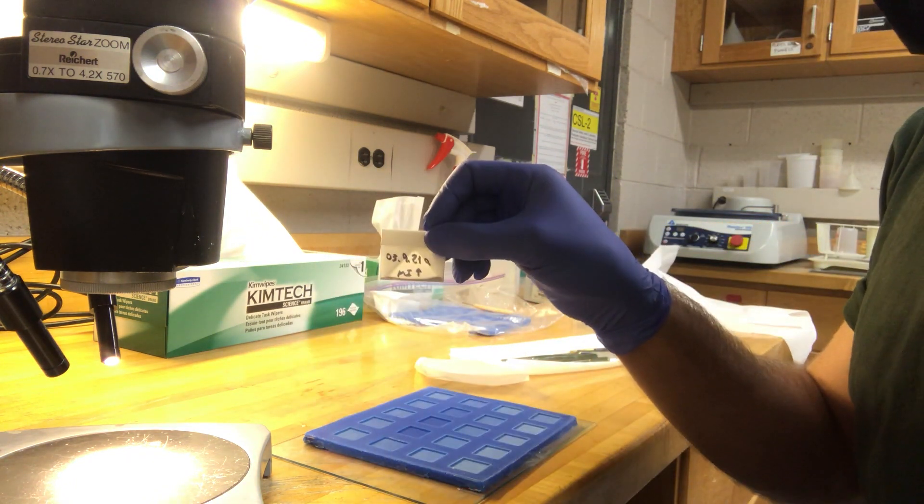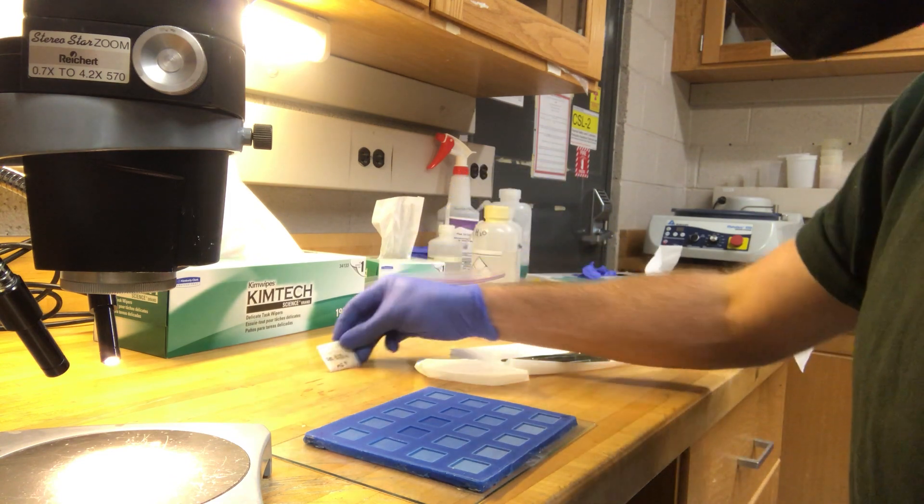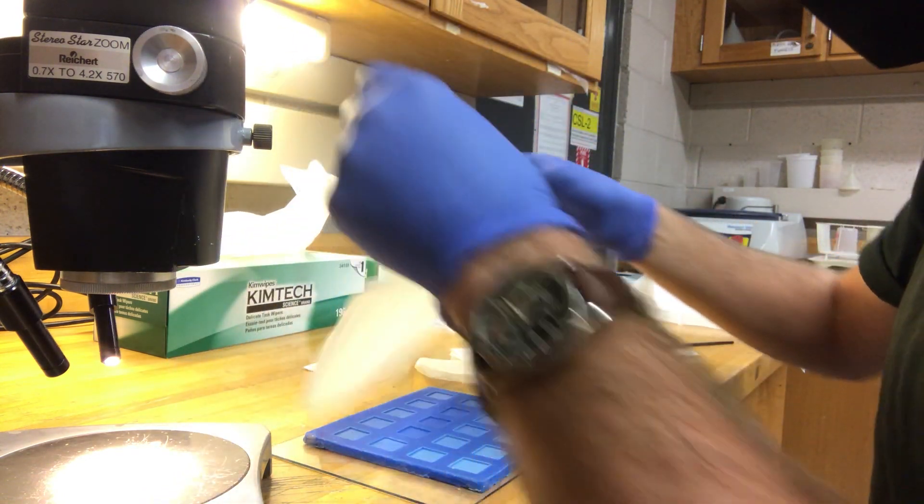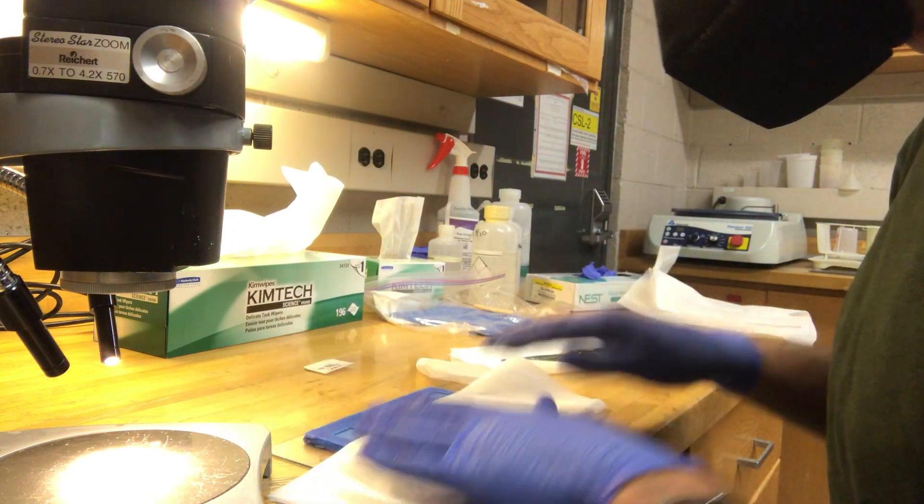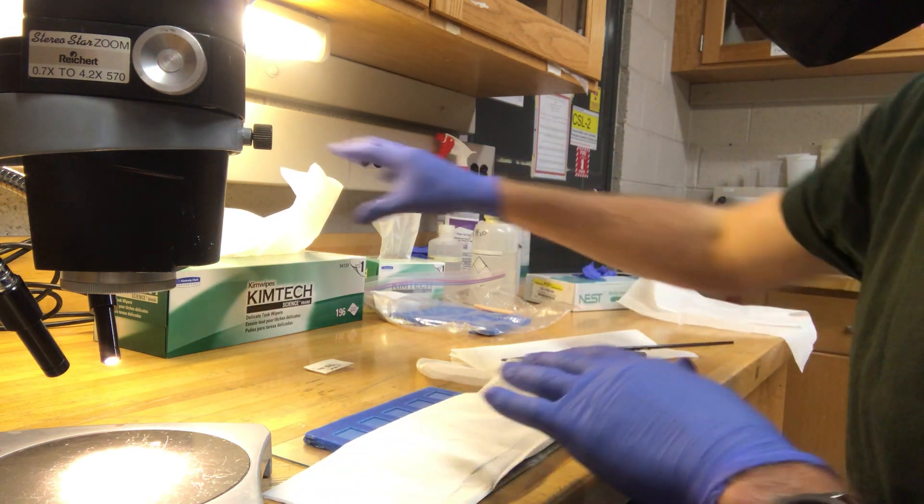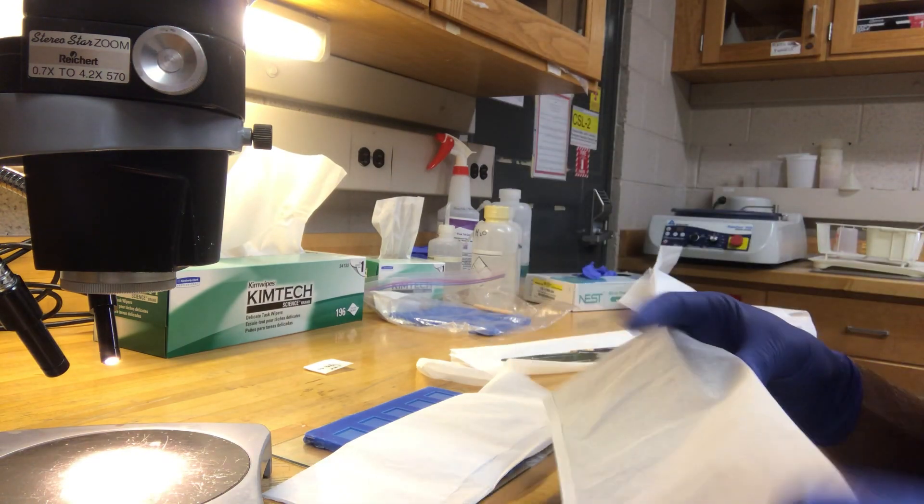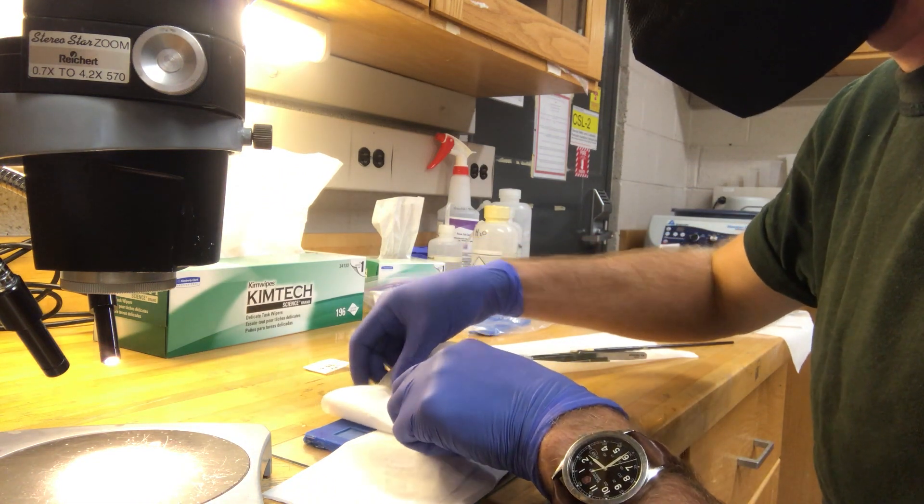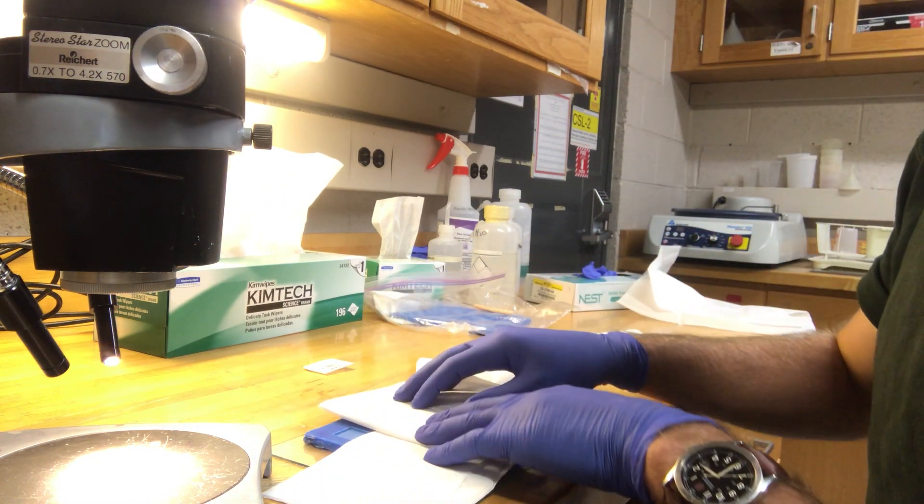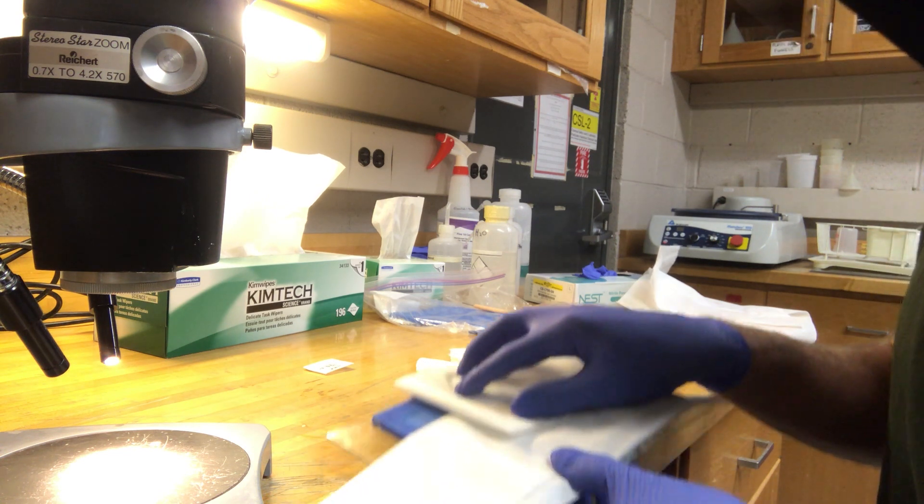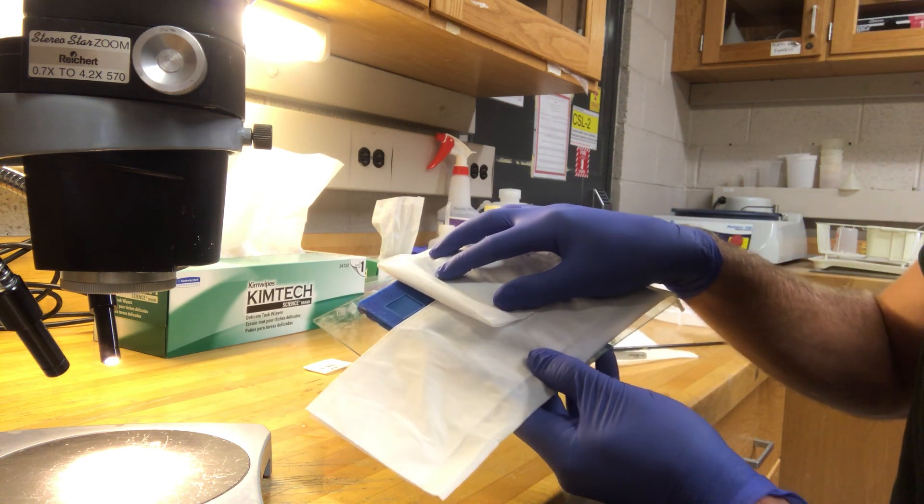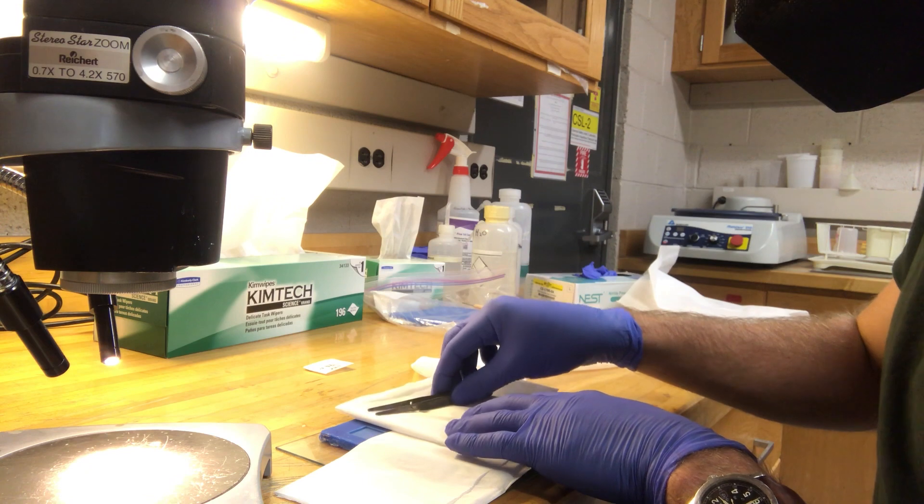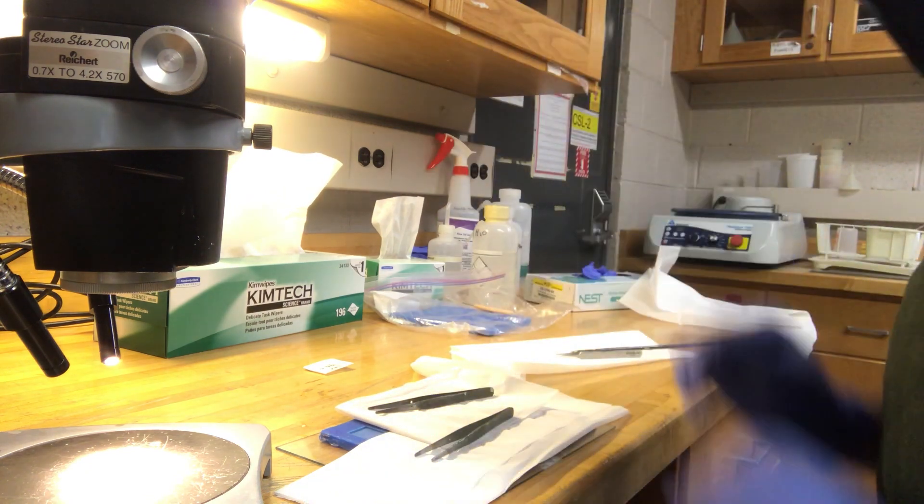What we do is get some kim wipes, fold them into nice big squares, and basically use it to cover the mold so we can avoid any contamination to other mounts when we're pouring. We've got all this kim wipe down and we're only exposing one space for us to pour our sample in. We can use these tweezers to weigh that down so it doesn't blow around in the vacuum.